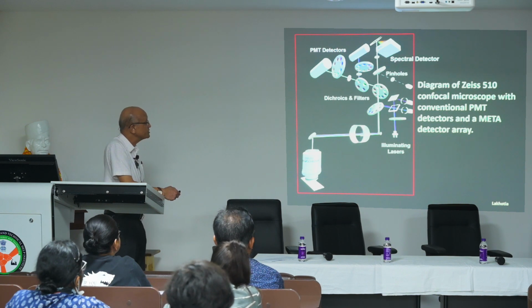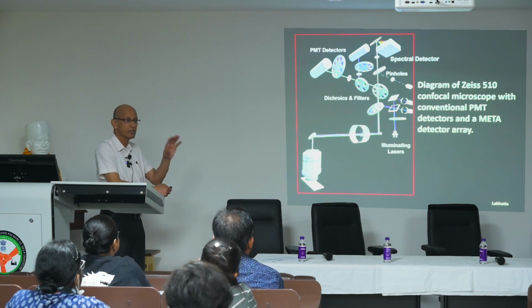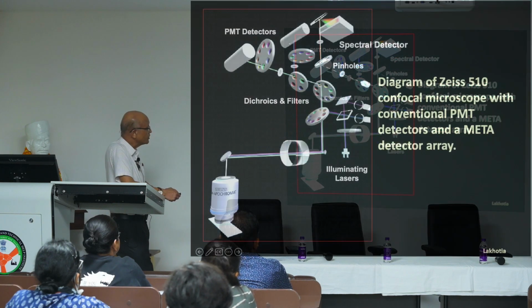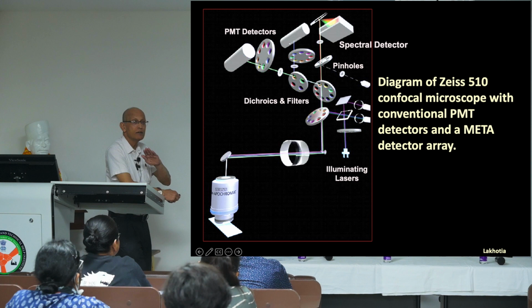So there are a series of these filter wheels. Some filters function as dichroics, some filters function as excitation filter or barrier filter. Depending upon, for example, if I were to take light from this laser, then I use a filter that will direct all the light down here. If I use this laser, again I use a filter that will direct all the light down here, and in this filter I use a plane transmission, no reflection, no absorption.